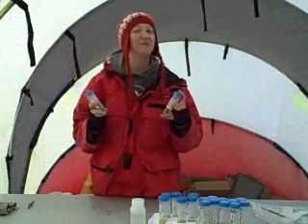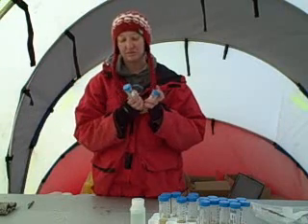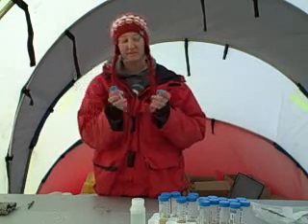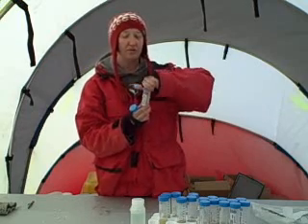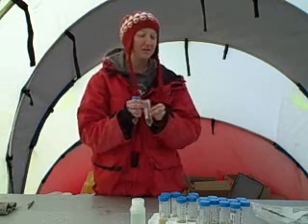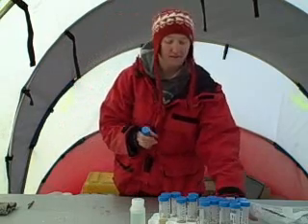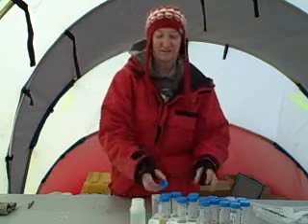Another place where microorganisms might be is in the air. So what we're going to do is take one of our vials that's going to be kept in the warm environment and the other one that's going to be kept in the cold environment, and we're going to just take their caps off and leave them open for 24 hours, and then tomorrow we're going to recap them and see what we get. So all we have to do for this one is just take the caps off and let them sit without anything on them.